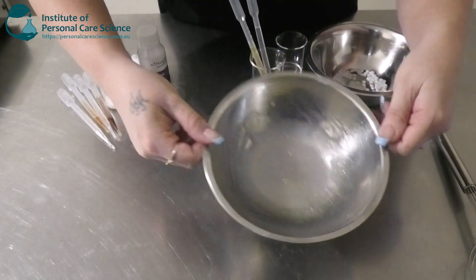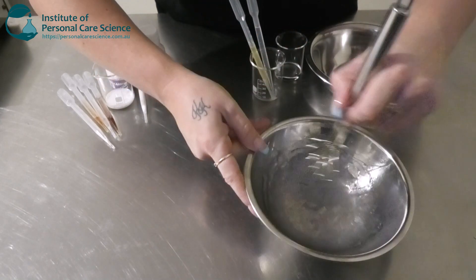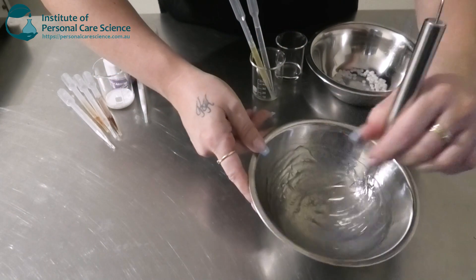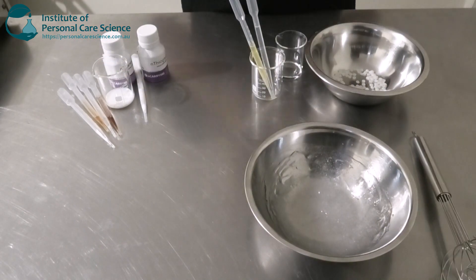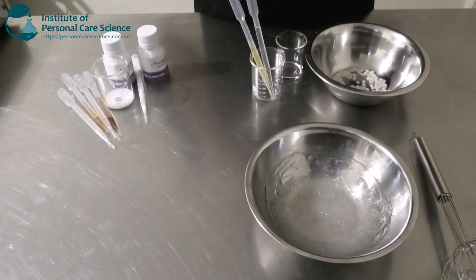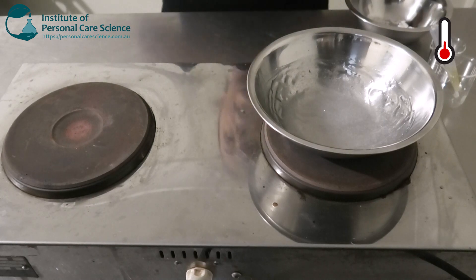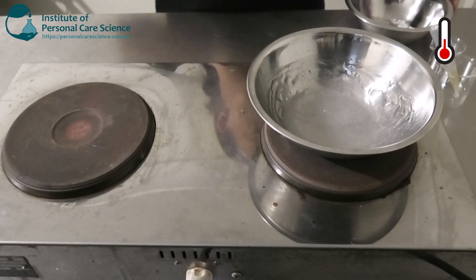Once your SepiMax Zen has hydrated, it will form a really nice stable gel, which is what we want to create really good stability in an environment where we're using some highly active ingredients. Now I'm just going to pop that on heat, and while that's heating, I'm going to put together my oil phase.